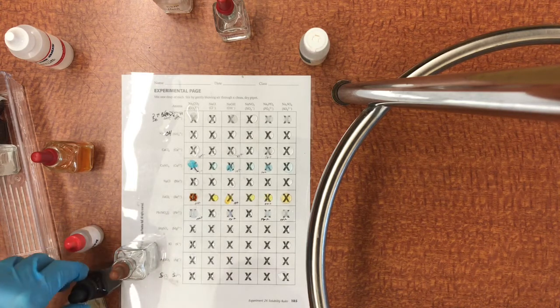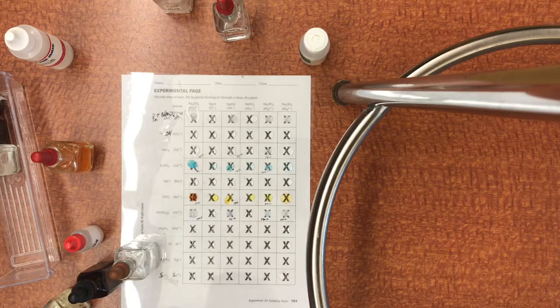Okay, we're going to take some magnesium now. Where is my magnesium? Oh, magnesium sulfate. And let's see what happens.